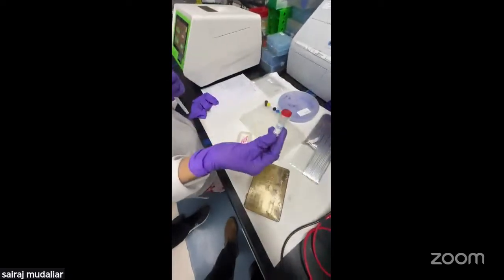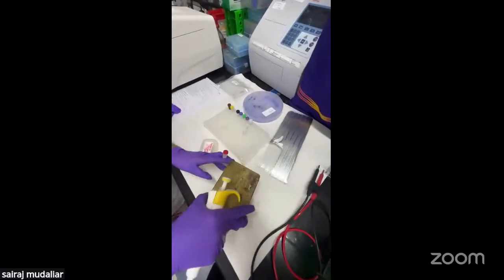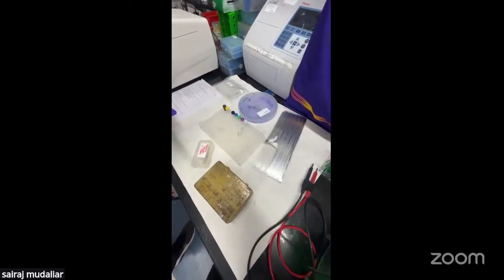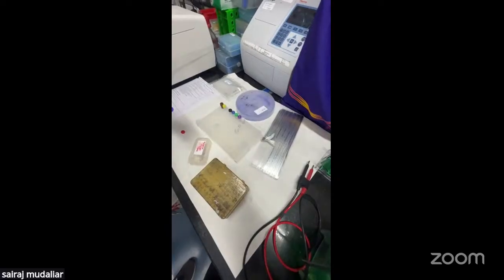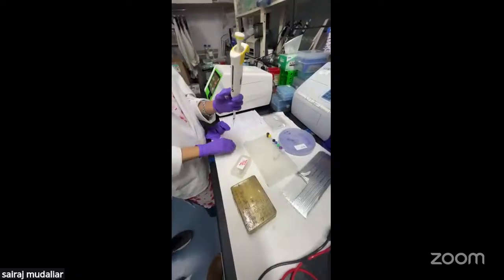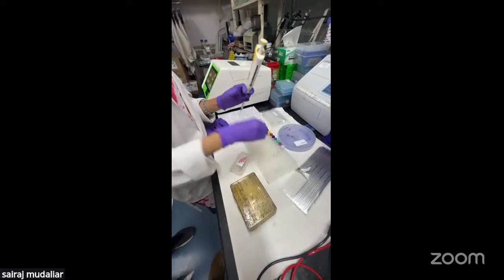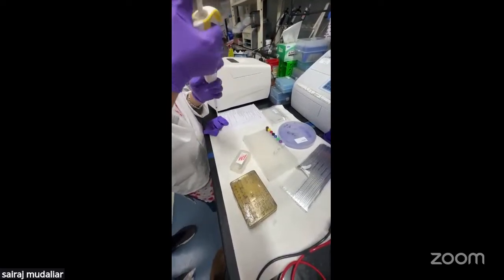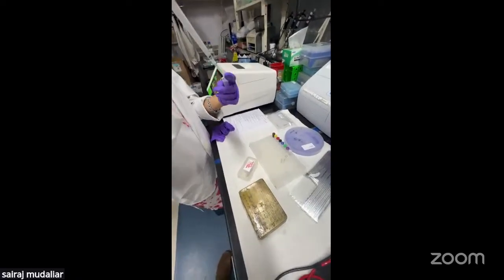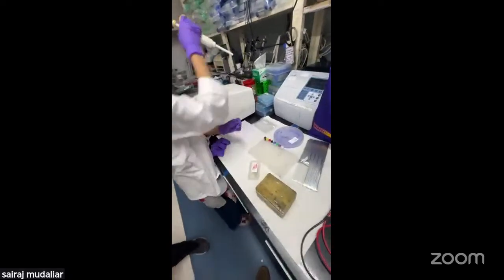So here we are now adding the trypsin solution. Once the trypsin is added, it is incubated for 4 hours.